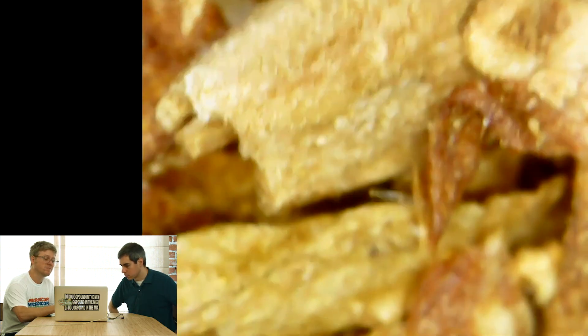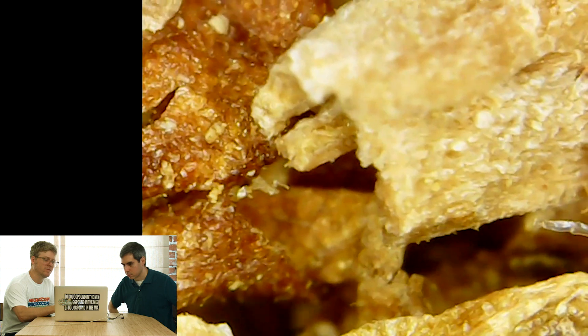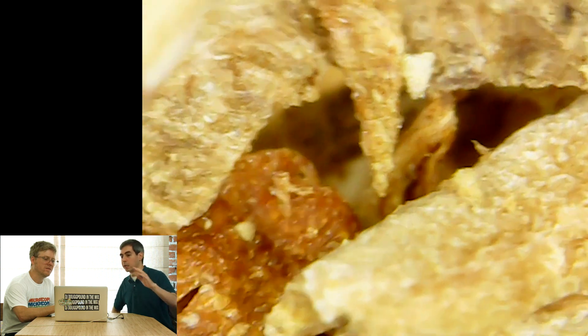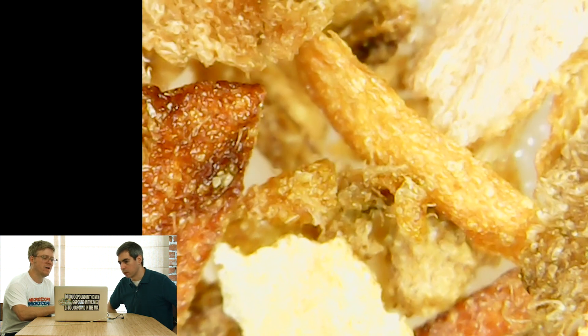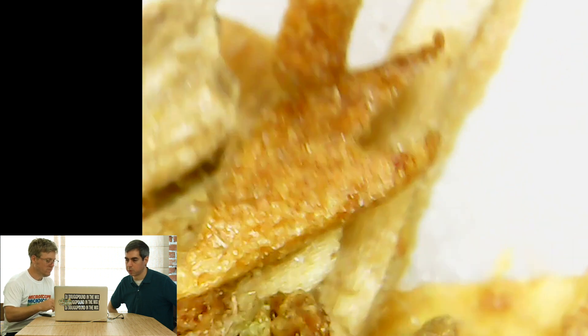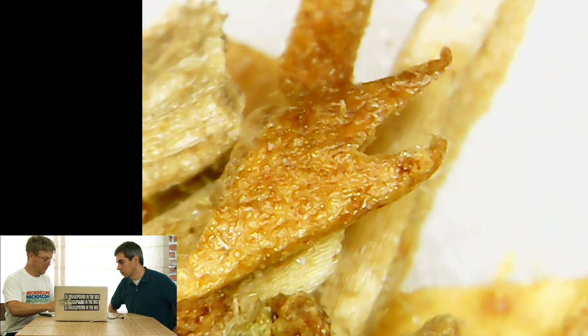I guess I could have bummed a few different other brands. We should have done a comparison — that'll be the next follow-up. A look at Marlboros, camels... Some of these pieces look more green and some bits look brown. When you look at it like this — and I'm not condoning smoking anything — it doesn't look that unhealthy. But it does smell bad. It's just a dried plant. Looks organic.